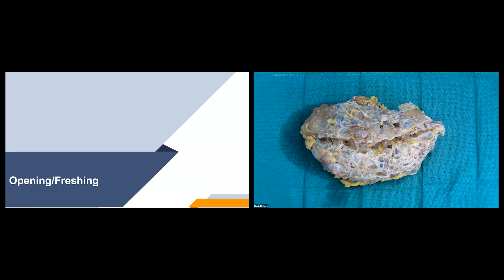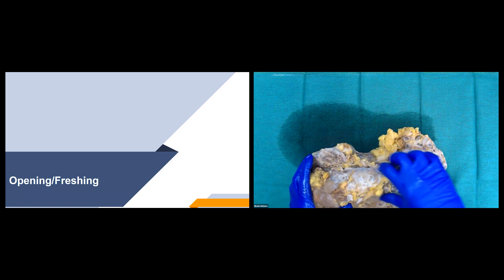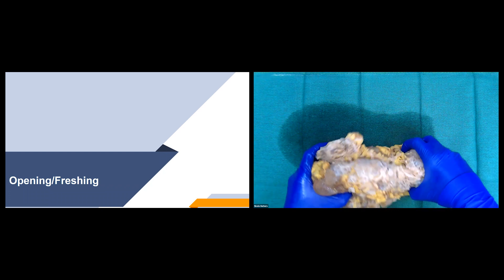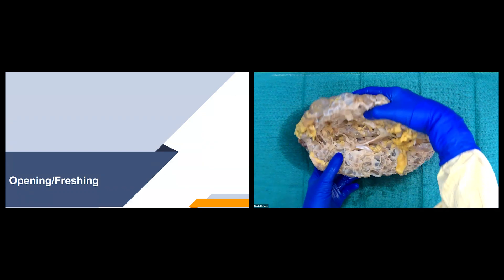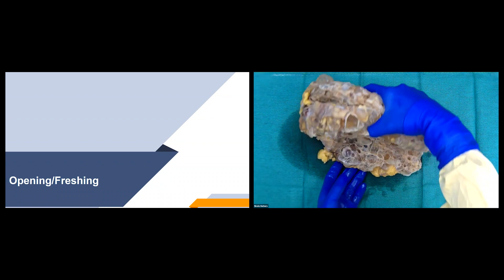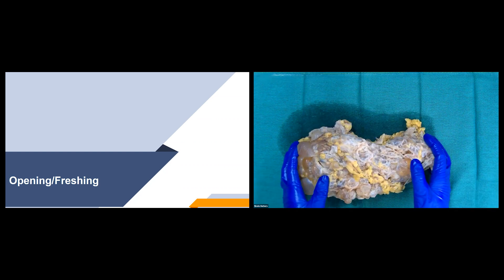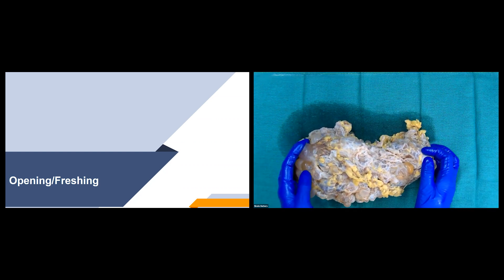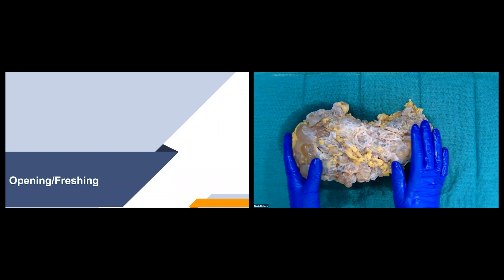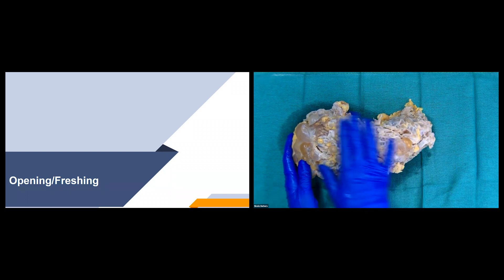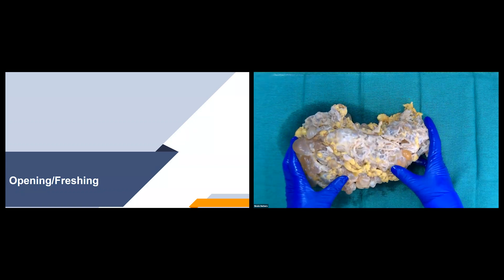Now we'll talk about opening and grossing these specimens. We first want to take the weight of the specimen before cutting, because as soon as we cut into it, a lot of the liquid from the cysts will come out and change the weight. Once weighed, we'll make a few cuts perpendicular to the hilum. For these cases, we don't usually need to ink the outside since they're not out for malignancy — but if there's any suspicion for malignancy, we would ink the perinephric soft tissue resection margin, which would be the whole exterior side.